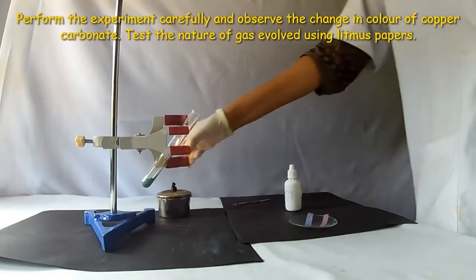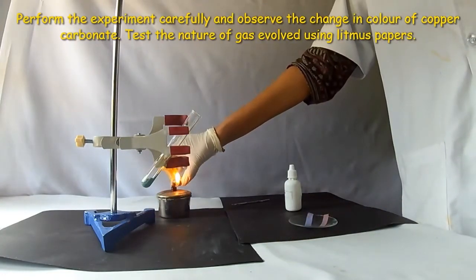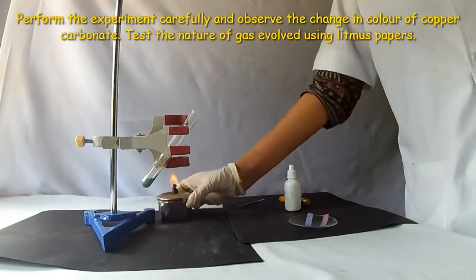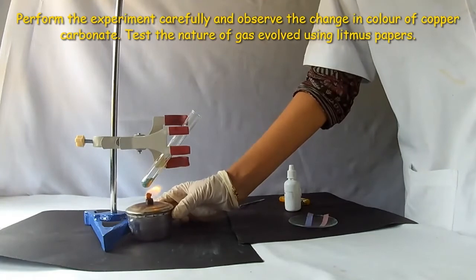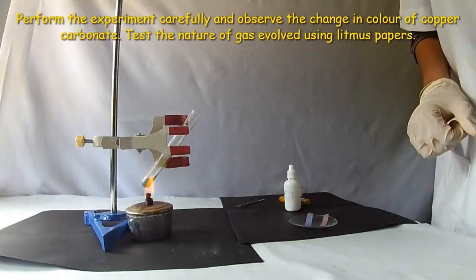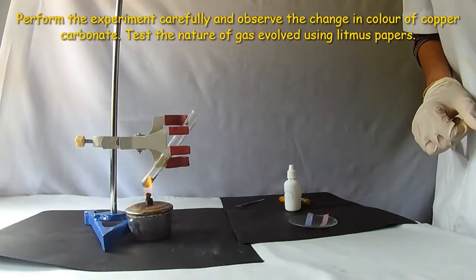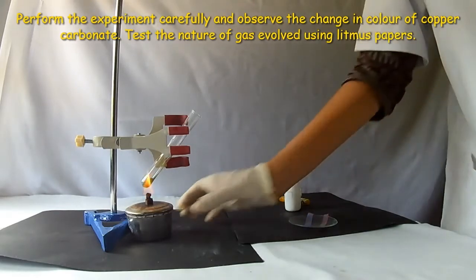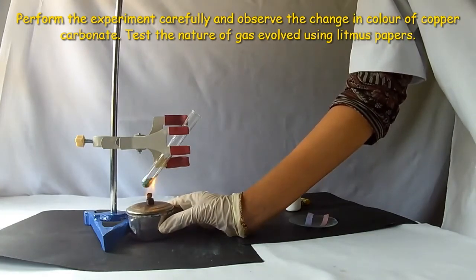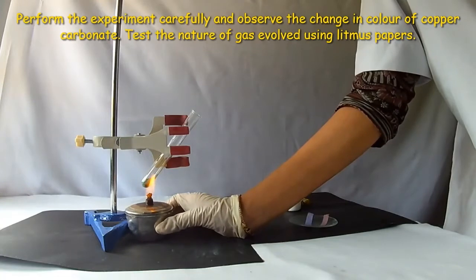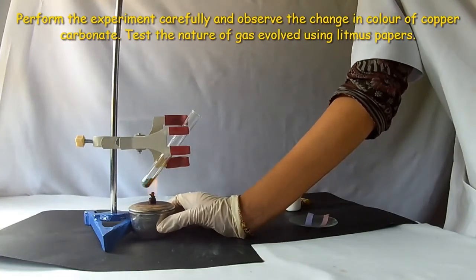Take a spirit lamp and light it with the help of lighter. Place it under the test tube correctly so that the salt gets heated properly. Perform the experiment carefully. Observe the color change in the salt.